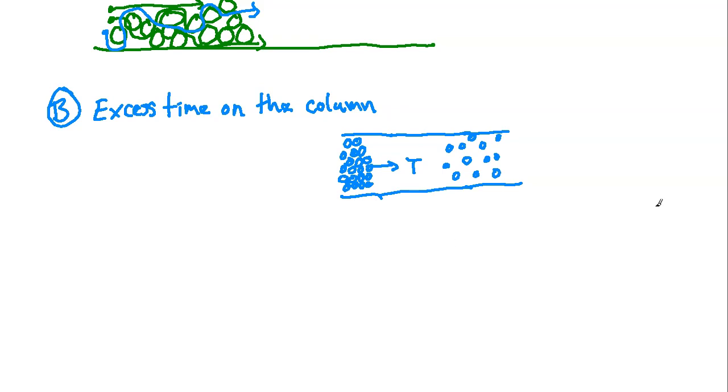Okay, so let's talk about the mass transfer. So this is C on our list, number 3. And when we start talking about mass transfer, this factor is going to relate to the fact that all of those particles that we pack into the stationary phase, so the actual, be it silica particles or whatever stationary particles you're putting on there that may have modifications, those individual particles or beads are generally going to be porous. And the reason that they're going to be porous, okay, is because that will increase the surface area.